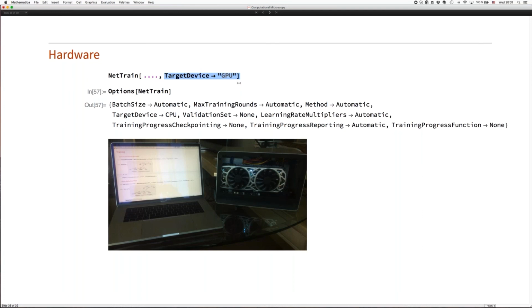Well, the answer is that it very much depends on the network and how you build it, because essentially to make it independent, you would have to do it very much like your brain, like your visual cortex does it, and that is run several neural networks in parallel, one working on coarse grain and the other one on fine grain objects, let's say 3 or maybe up to 5 networks doing it in parallel. And then they could combine their output, and that would make your network scale independent.